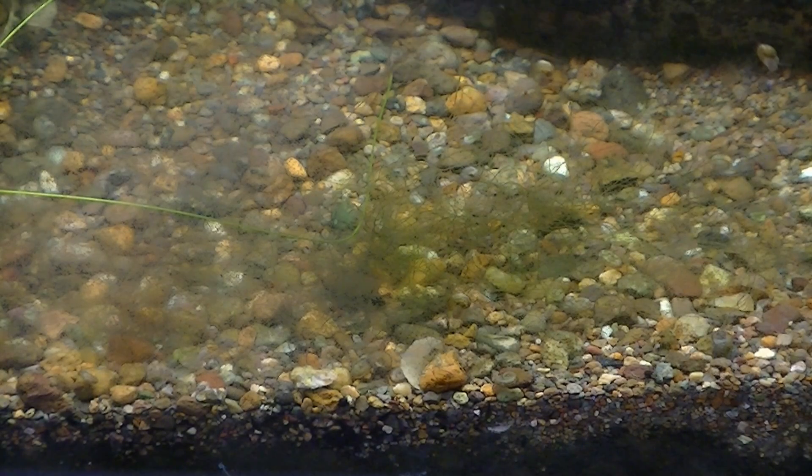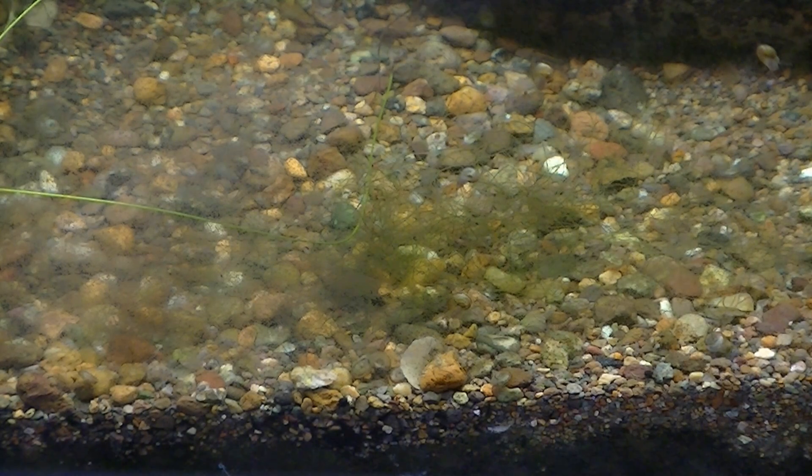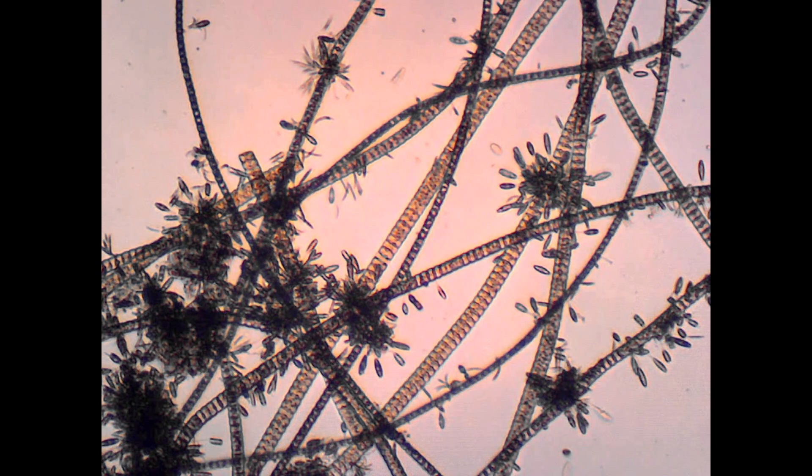Now let's take a look at some brown, hair-like algae found on the bottom of an aquarium. Right away, we notice a big morphological difference.